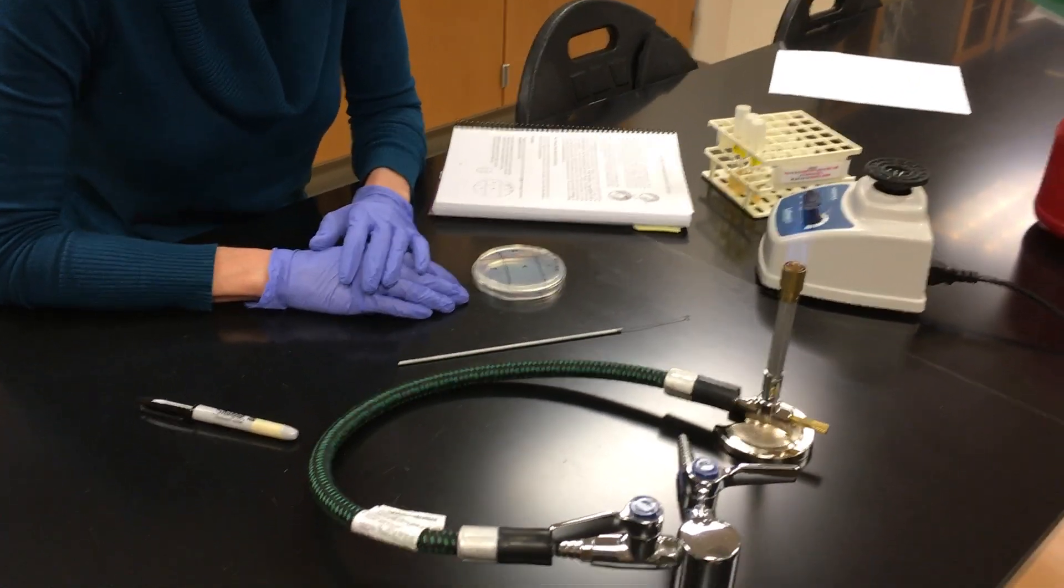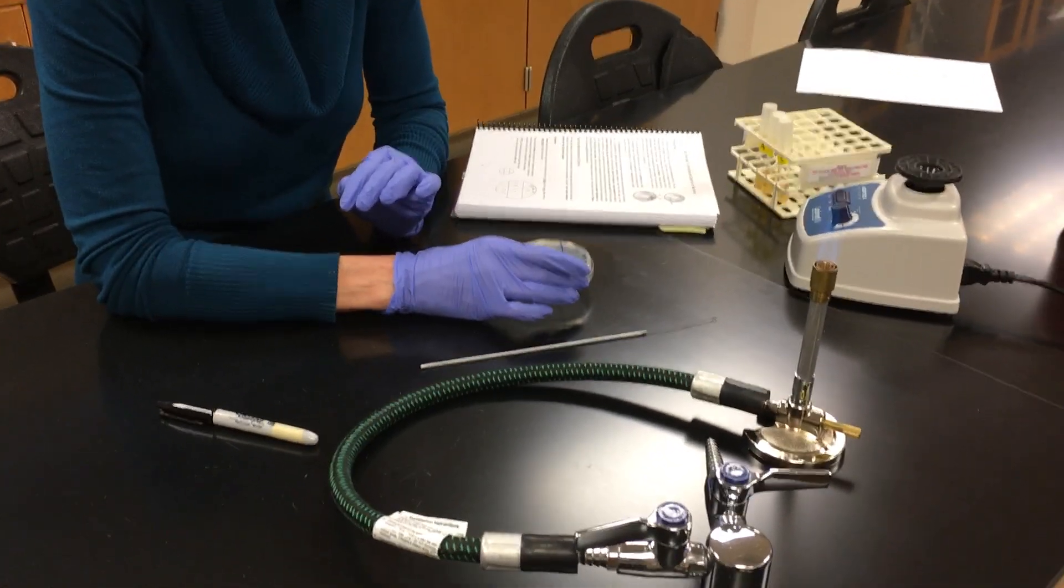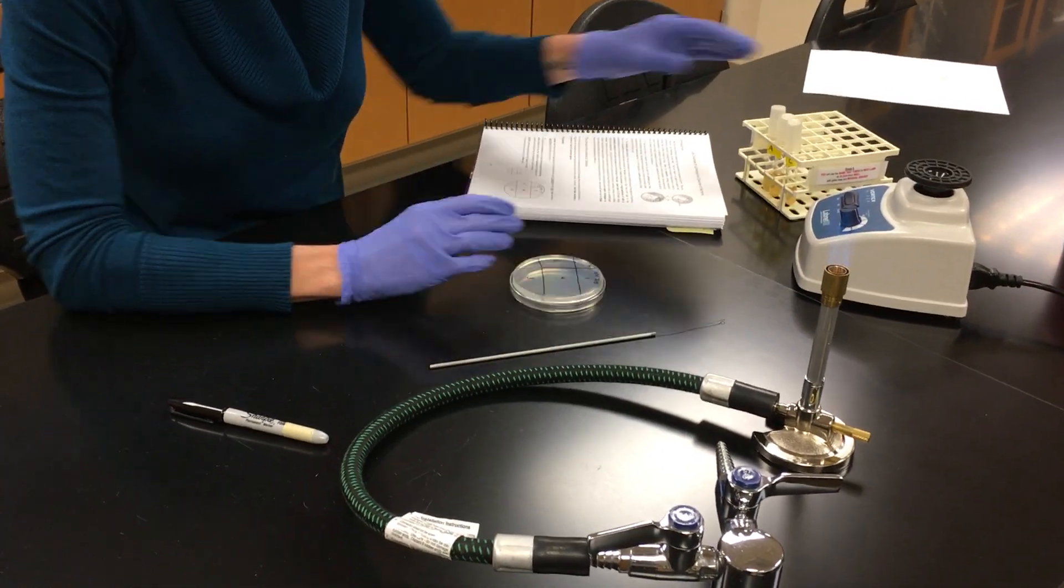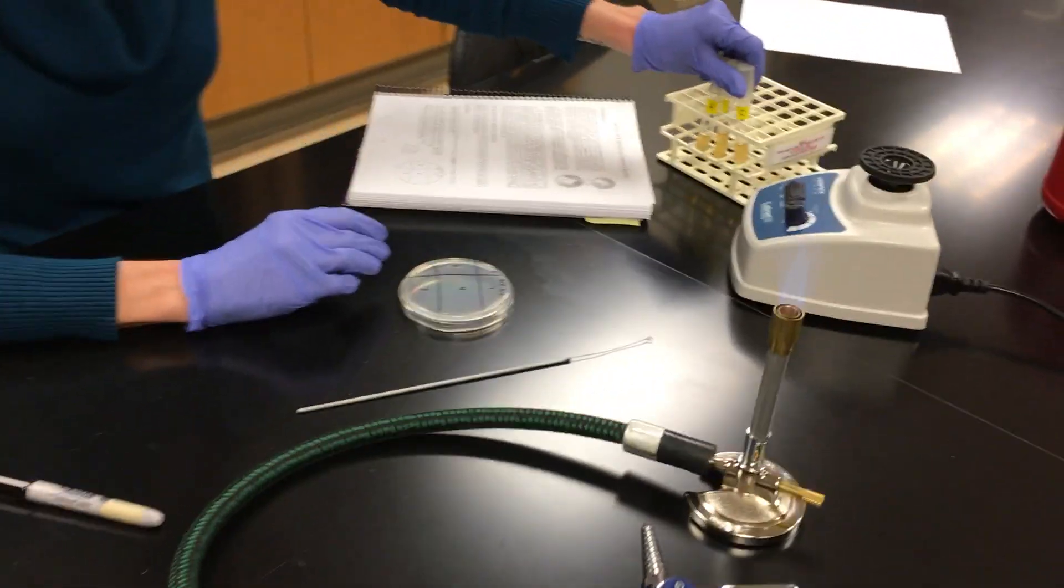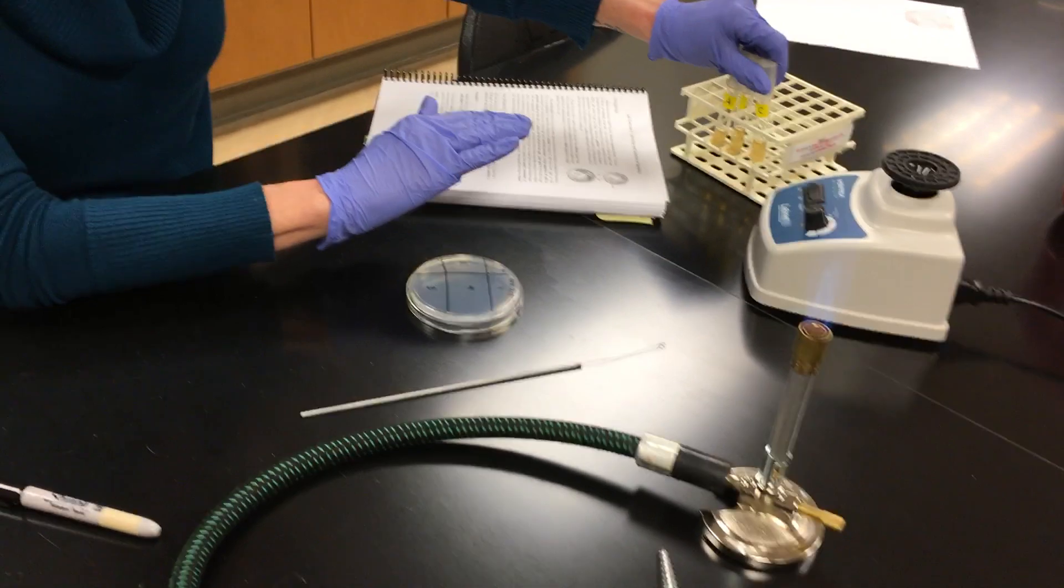Okay, so today I'm going to show you how to streak a culture plate for isolation. So today we're going to use three different mixed cultures, so they're labeled A, B, and C for you.